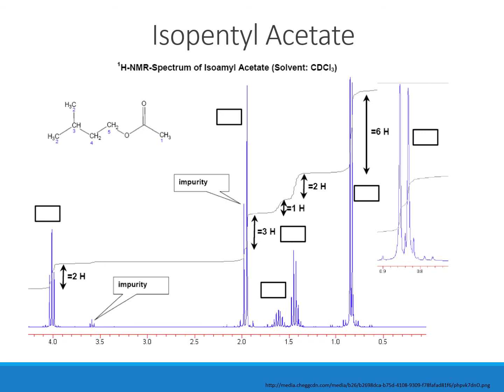The reagents we use can be clean, but not as clean as needed to synthesize a pure organic compound. Anyway, you're going to have impurities. So in research, it will not be easy to just elucidate the structure of an organic compound. There are also many other parameters that we apply, and this slide is to show you that you should be cautious in such spectrum readings, right?